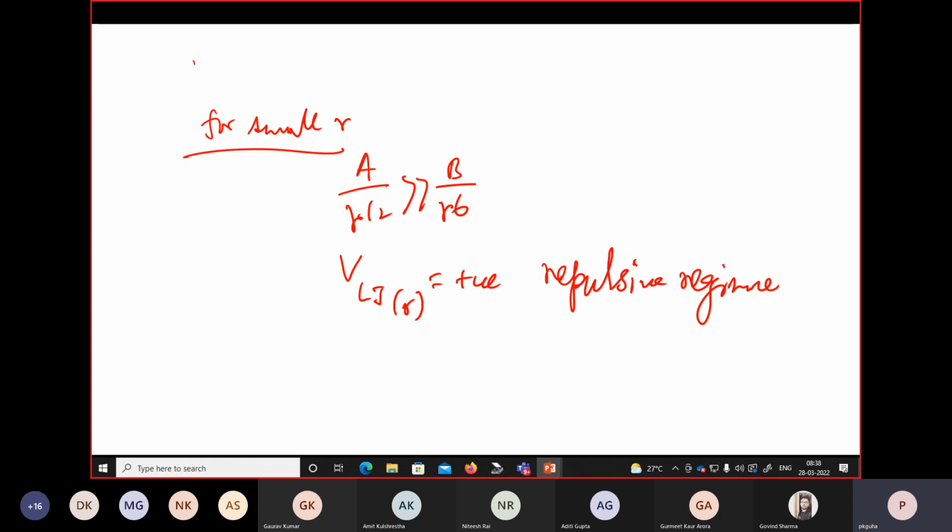So your probe is scanning over the surface and we are basically measuring the deflection of the probe while it is moving on the surface. Why there will be deflection? Because there will be change in force, right? There will be change in force because the surface of the nanomaterial is irregular. So in some place the tip will be much closer to the surface, and in some place the tip will be away from the surface. So this will give you some deflection in the tip, right?